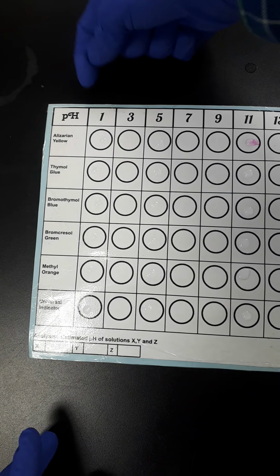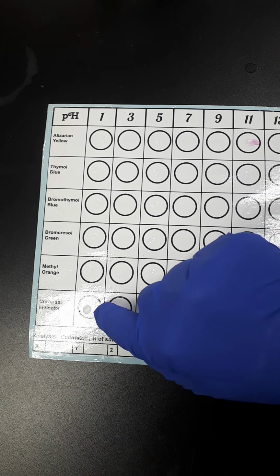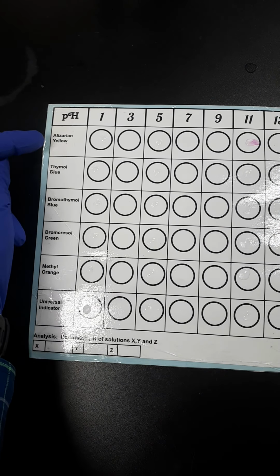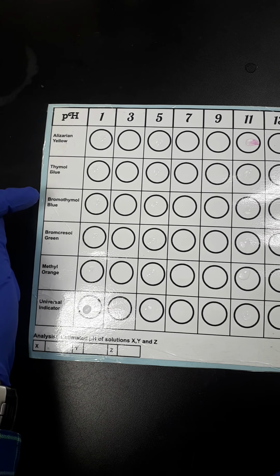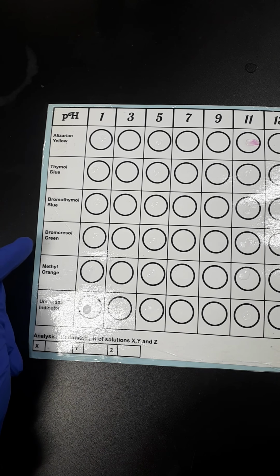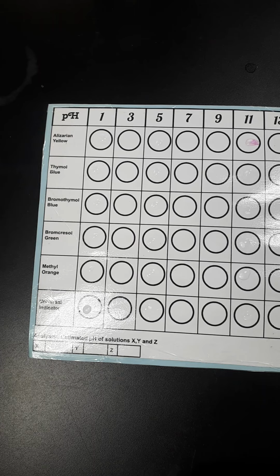So what I've got, pH 1, I've put a little drop in every single one of these spot plates, and then we're going to look at it. We're going to look at alizarin yellow, thymol blue, bromothymol blue, bromocresol green, methyl orange, and then something called universal indicator that we haven't talked about yet.